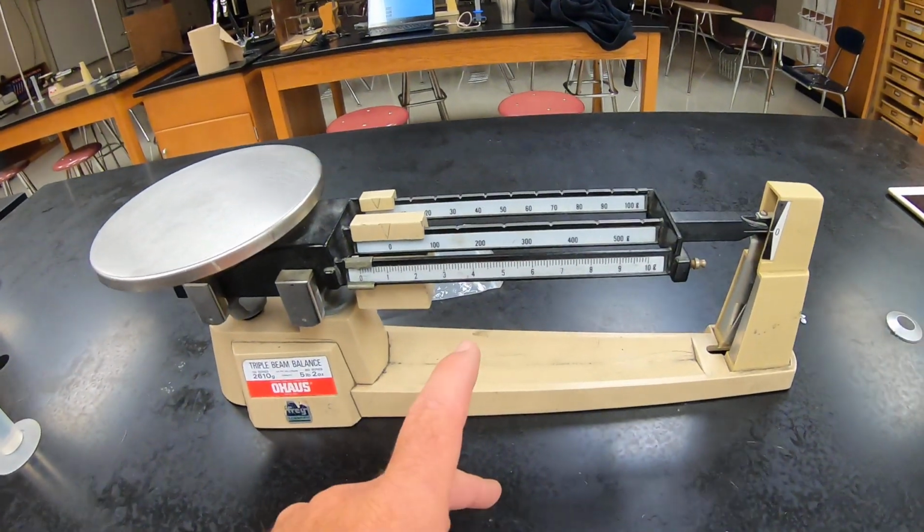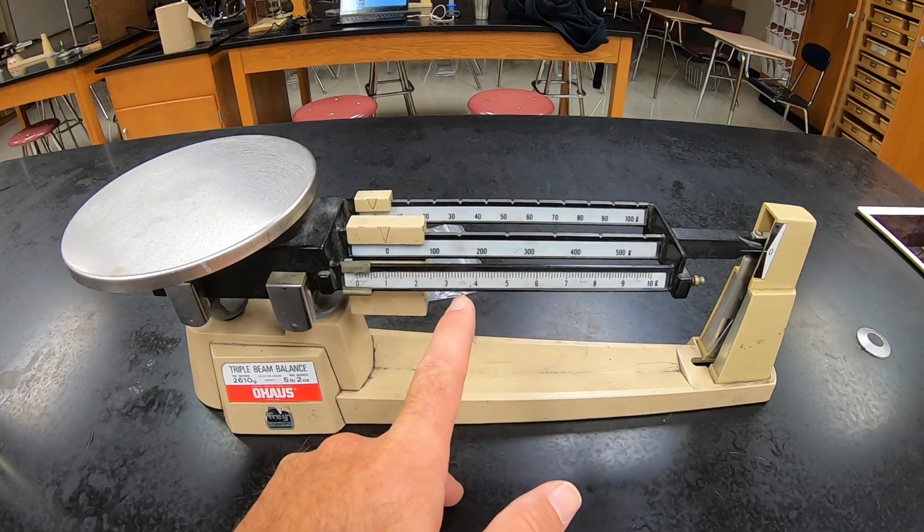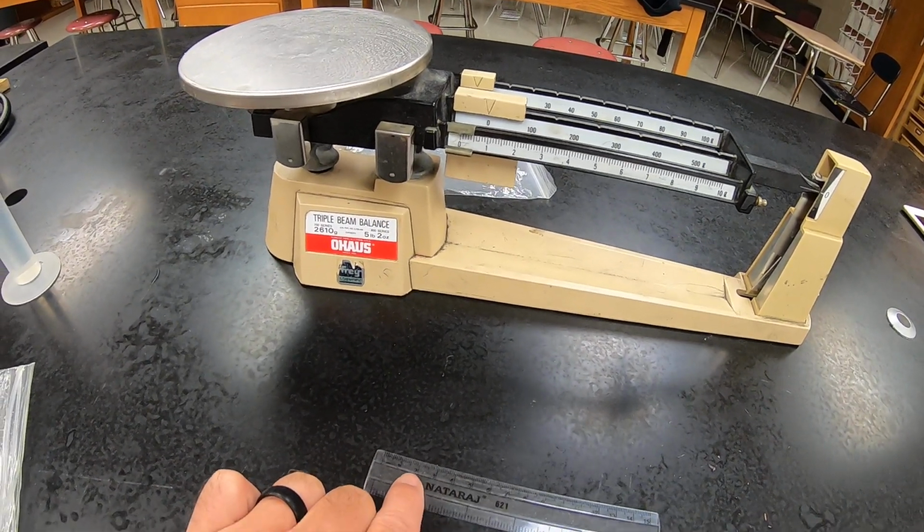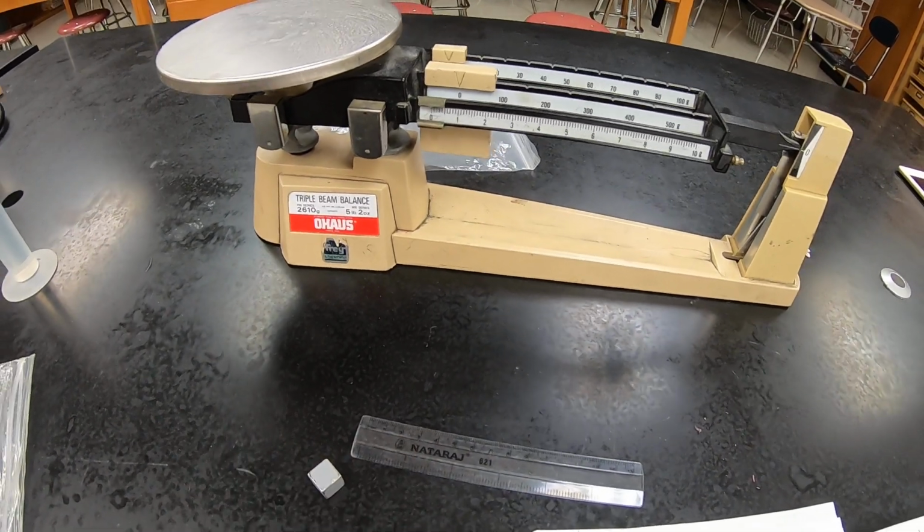Remember, we always measure one place beyond what the scale gives us. Our triple beam balance goes to the tenths place, so we're going to estimate to the hundredths place. And our rulers, we're going to use the centimeter side, and it goes to the tenths place, so we're also going to estimate to the hundredths place.